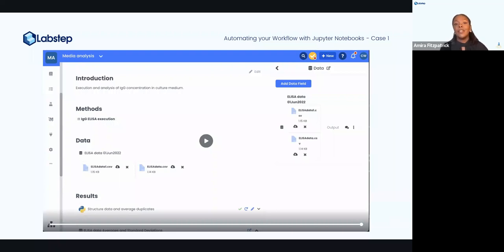That's really cool. Ethan, I don't know if we have any questions in the chat that we want to talk about before we move on to the next example. No questions in the chat at the moment, but personally, I do have one actually, because I'm not very knowledgeable with Jupyter Notebooks, admittedly. So this is as much of a webinar for everyone else as it is for me. So just some simple things.